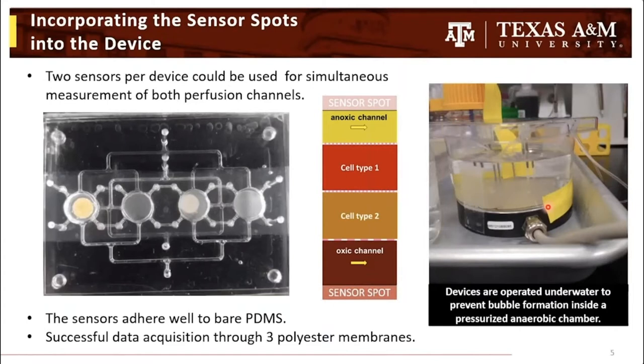And so the way we overcame this issue was by covering the device with water, because that water basically acted as a barrier that prevented the direct action of the atmosphere in the anaerobic chamber on the chip. And so thanks to that little trick, we were able to operate this device inside the anaerobic chamber without bubble formation.